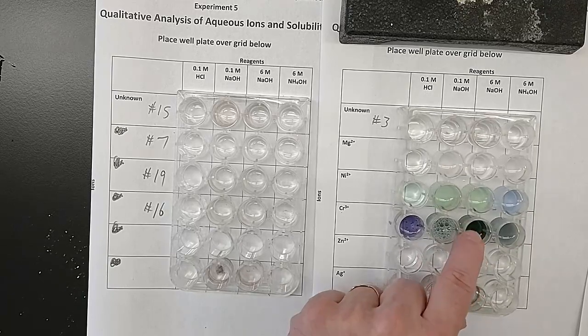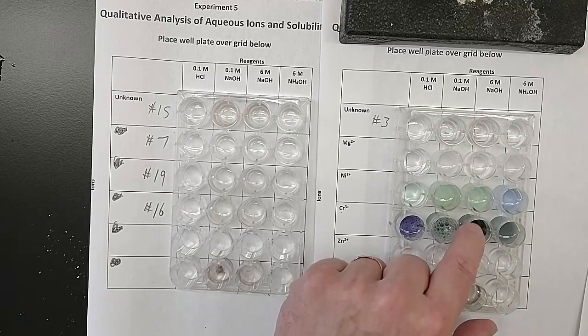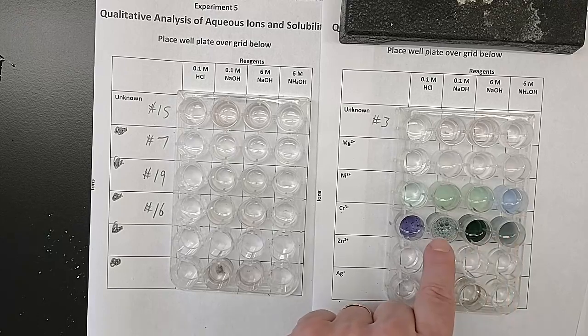This one, if you look carefully, you can still see the line from the grid underneath it. So this is a clear, dark, even green. And then this last one is a cloudy green that's the same as this.